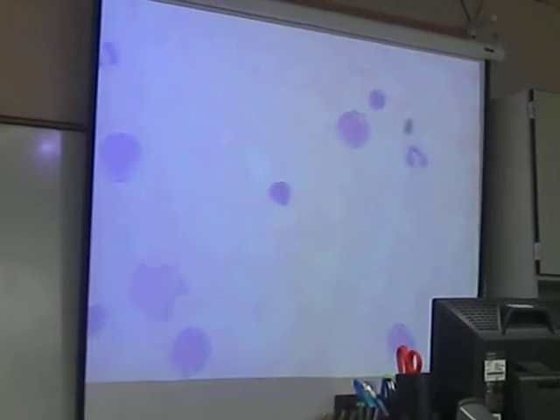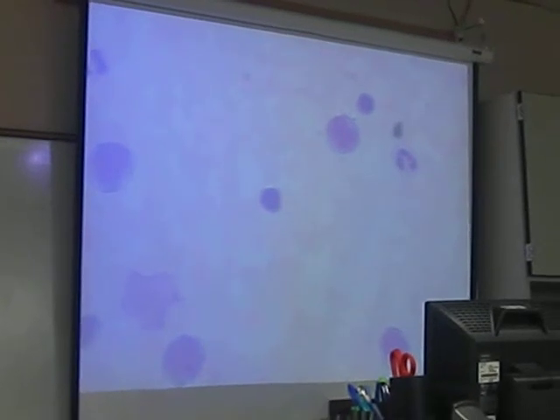But we're going to finish this up. We'll do most of the wet stuff from Lab 12 on Wednesday. We'll do blood typing and some other things on Wednesday. But for this evening, I want you to pull out the slide of the blood stain, and you want to be able to identify the different blood cells.